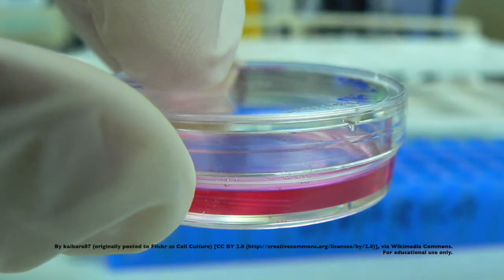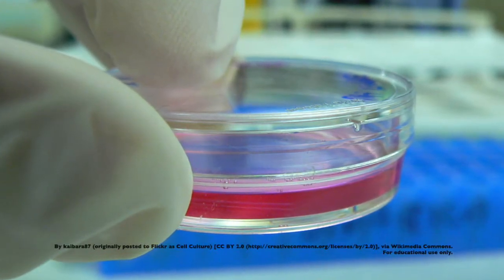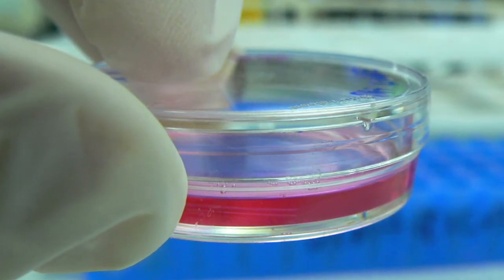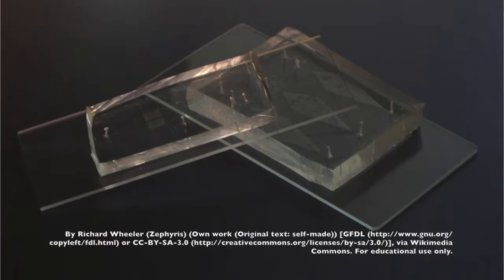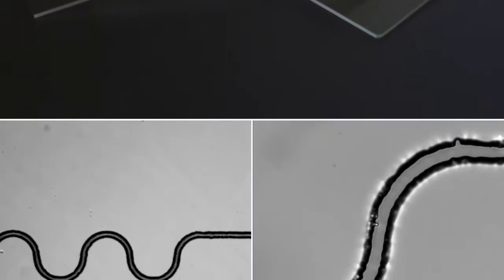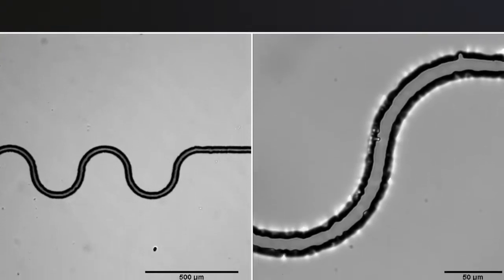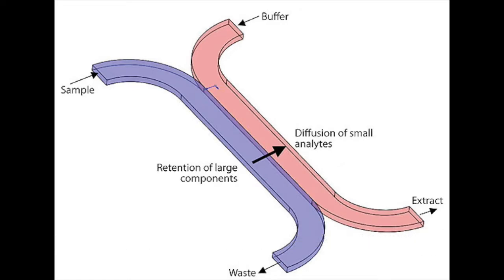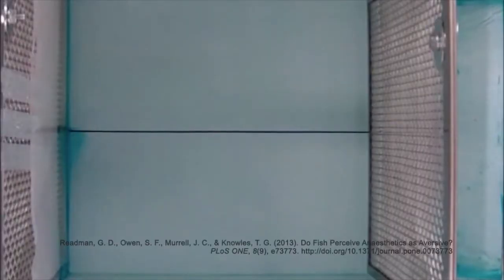Current lab testing to determine the infecting agent requires culturing samples taken from whole blood, which can take time and resources. To overcome this diagnosis issue, we propose using microfluidics, which deals with the behavior, precise control, and manipulation of fluids at a sub-millimeter or a micrometer scale. Specifically, microfluidic channels allow for controlled diffusion of particles because of laminar flow, which is the parallel flow of fluid streams at low velocities to prevent lateral turbulent mixing.